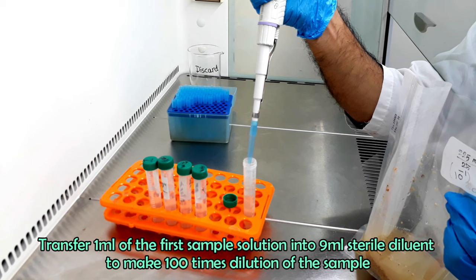Sum of colony in first counted dilution is 1496 and we got this count in 10 inverse 5 dilution. Sum of colony in second counted dilution is 163 and we got this count in 10 inverse 6 dilution. Number of plates of first dilution is 2 because we counted trial 1 and trial 2 of 10 inverse 5 dilution. Number of plates of second dilution is also 2. Our first count was from 10 inverse 5 dilution, that's why D is 10 inverse 5. Now we are ready for the calculation. Put the values in the equation 1.